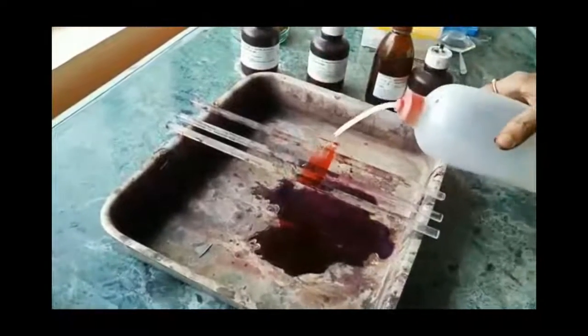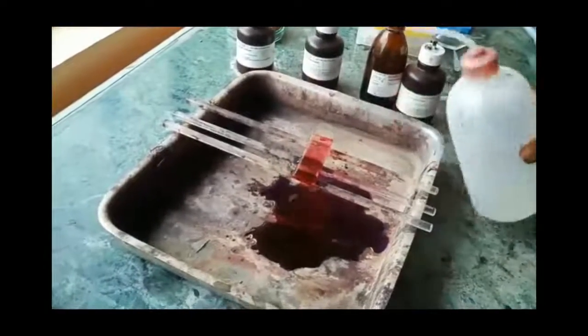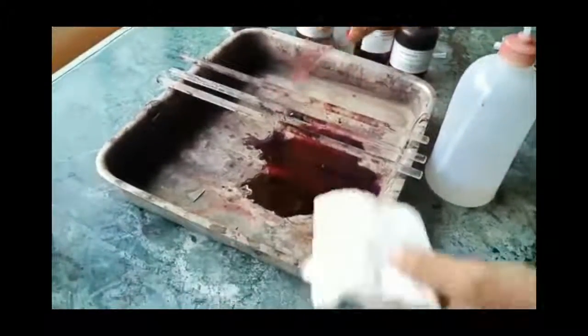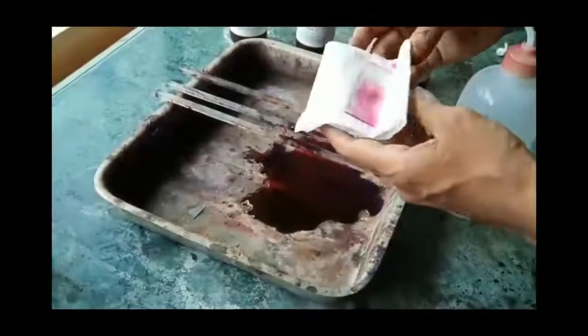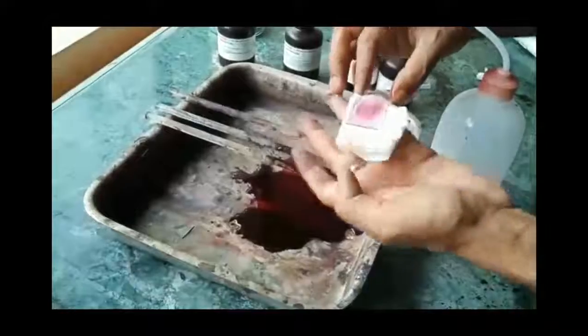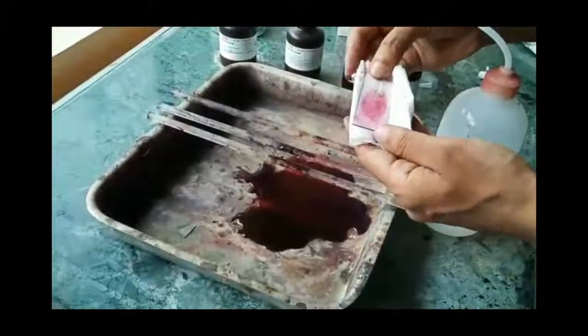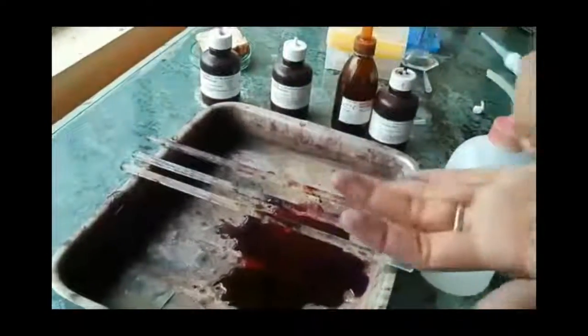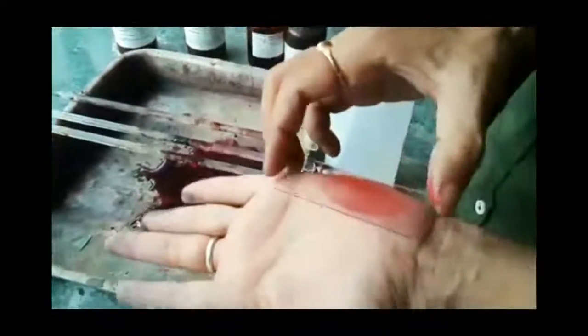After that, we need to blot dry the glass slide with blotting paper. We need to properly allow it to dry, keeping in mind that the smear is not washed away. The sides or the corners of the slides are also dried.